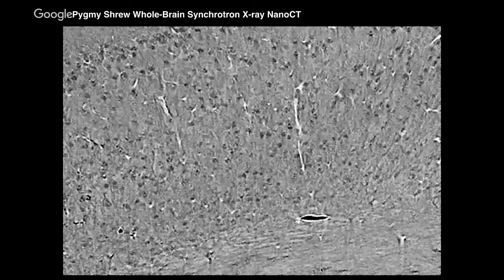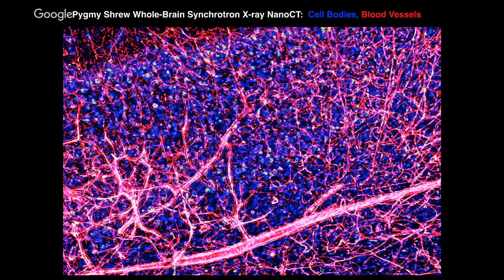Now that's fine, but what's interesting is, this is showing if you use a lookup table and just color code pixels and do a projection type image. So this is just identifying the cell bodies in blue and the vasculature in red. And again, this is not using any sort of machine learning; there's nothing here except using a lookup table to color code things according to the grayscale intensity level. And so this is promising.